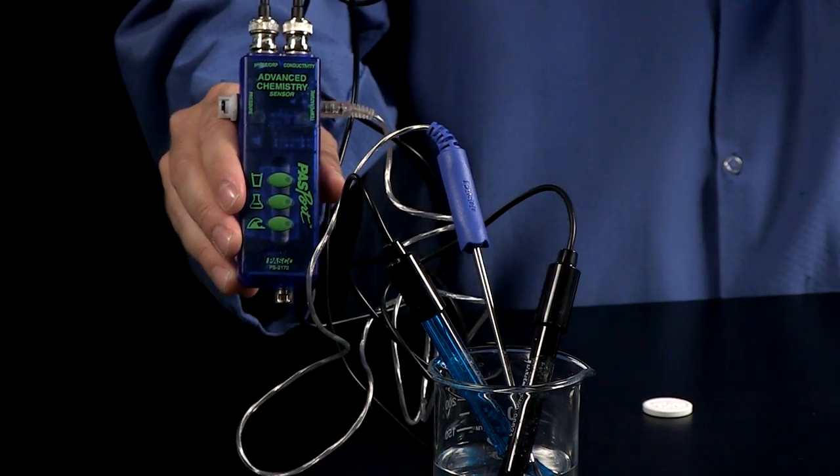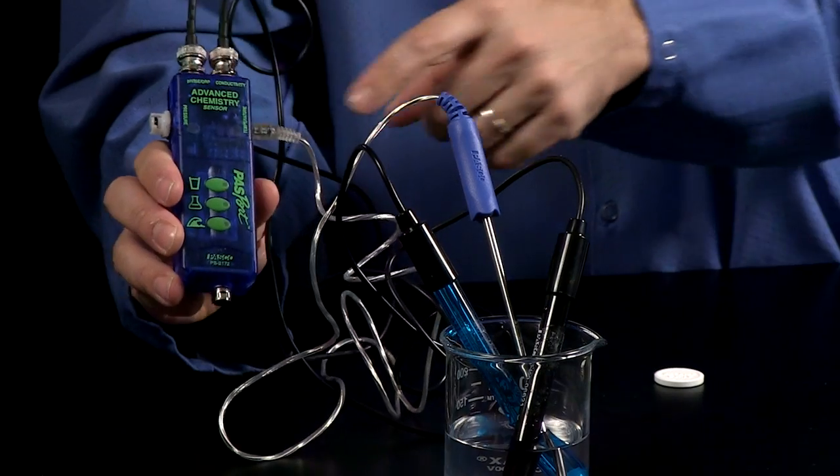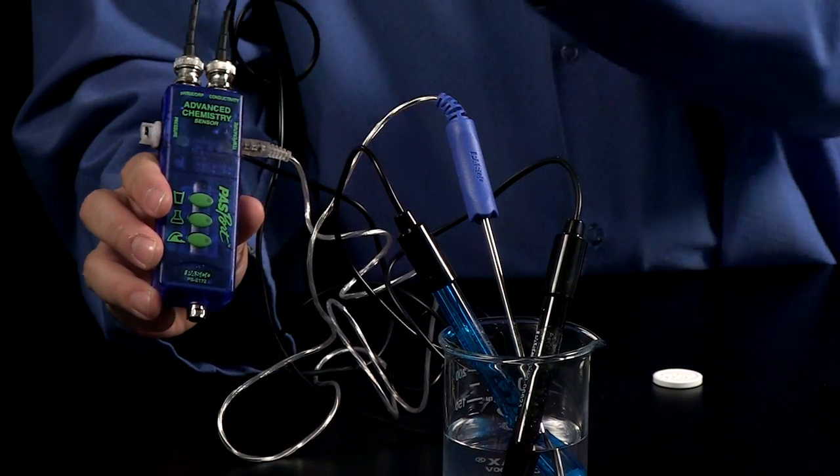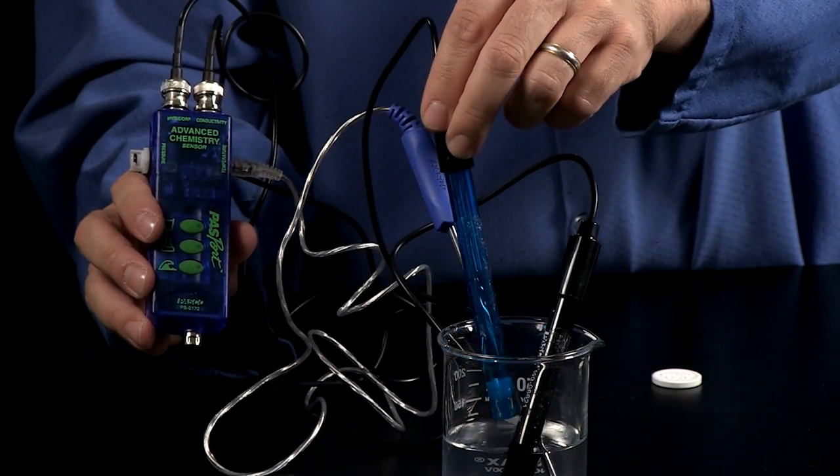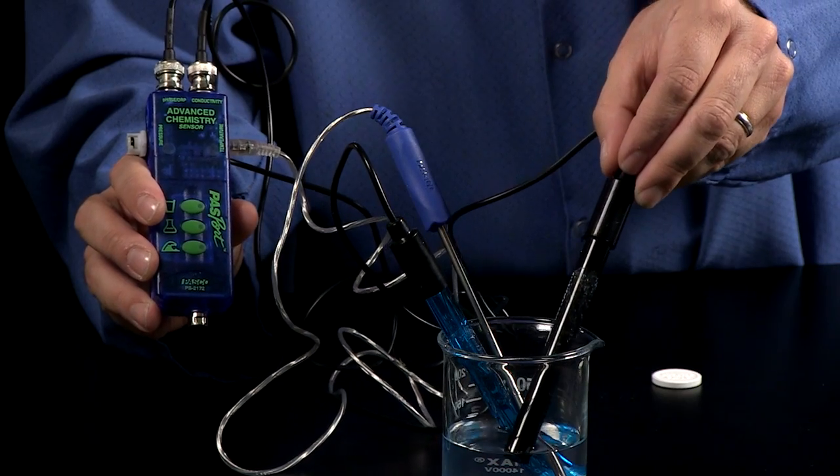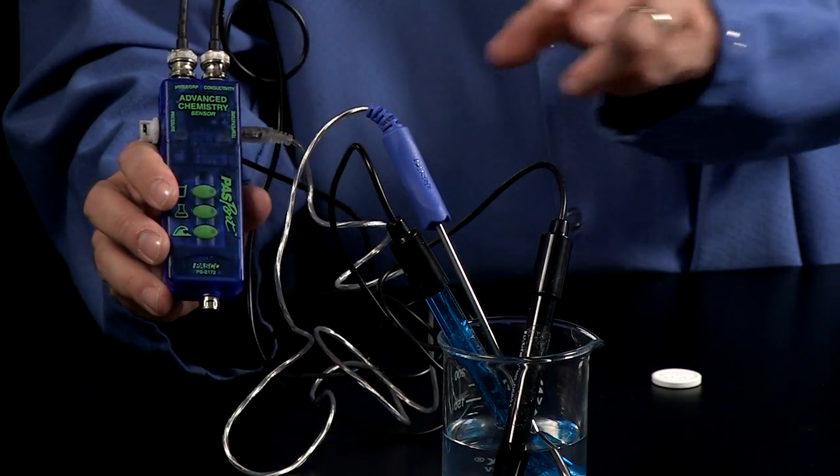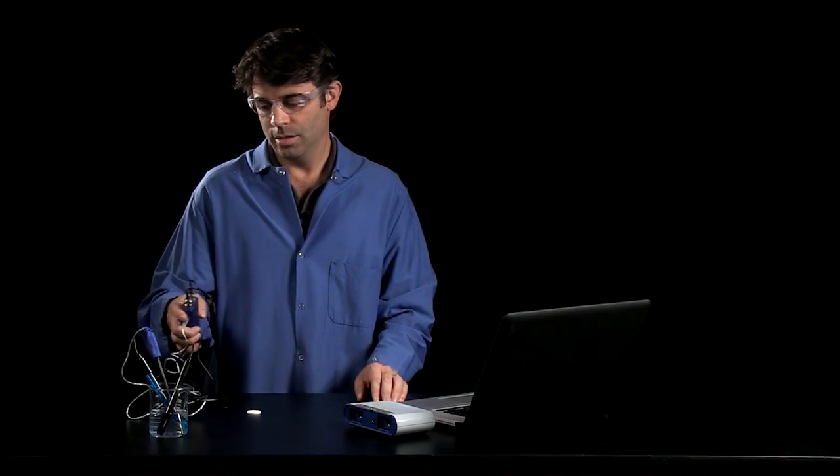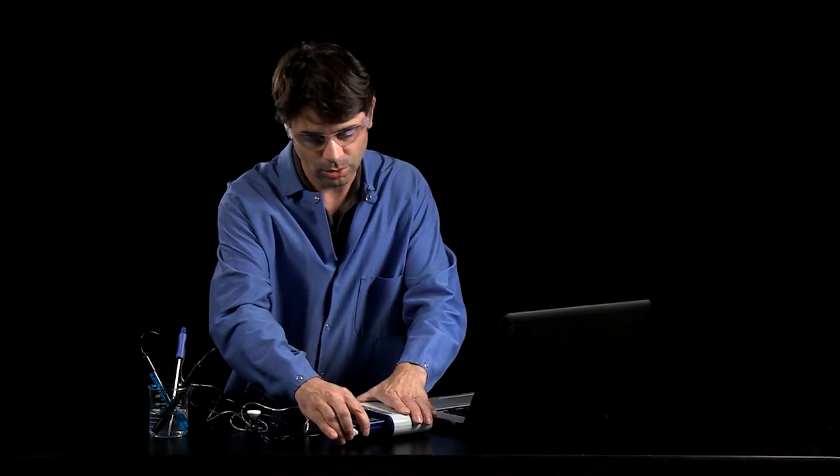The Advanced Chemistry Sensor is designed especially for chemistry. It's a new multi-measure sensor that can measure pressure for gas laws, has a port for pH measurement, conductivity with a 10x conductivity probe, and temperature that comes with a stainless steel temperature probe. Because it has all these measurements, I can make all those measurements individually or simultaneously.